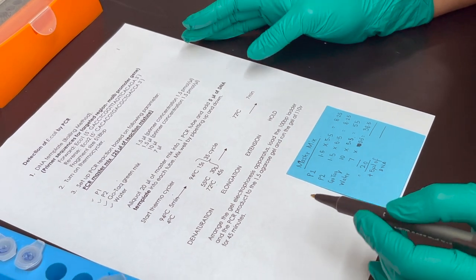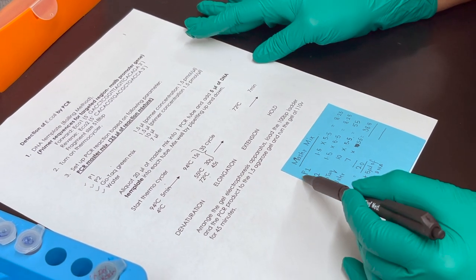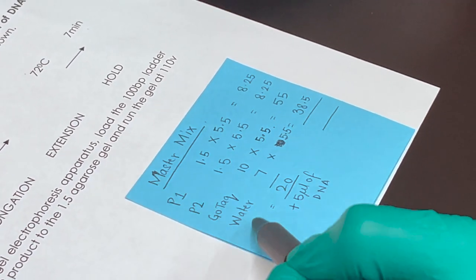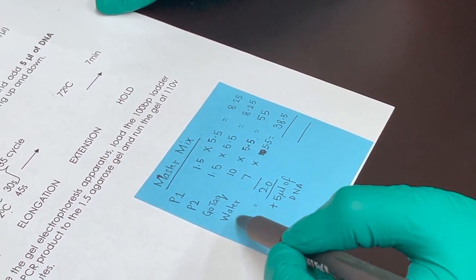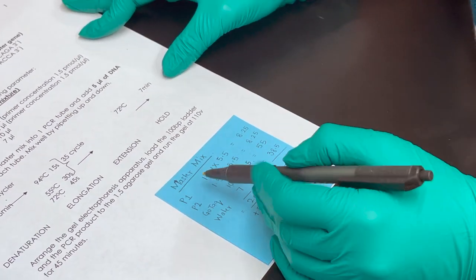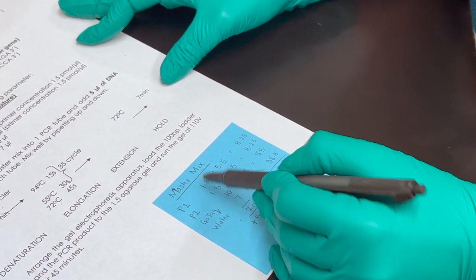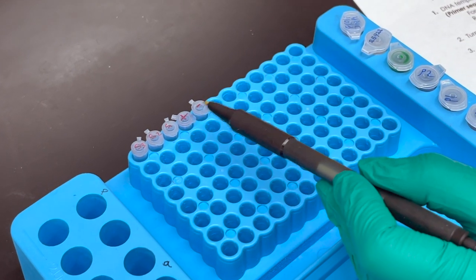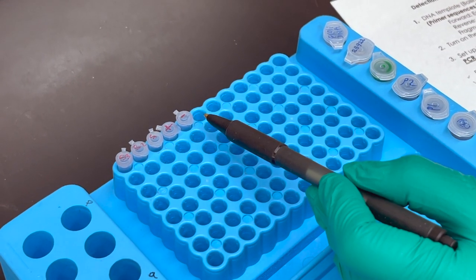To prepare our master mix, we have the forward and reverse primers, GOTAC, and water. The amounts needed in microliters are: 1.5 µL of each primer, 10 µL of GOTAC, and 7 µL of water. We have five samples altogether — one positive control, one negative control, and three replicates of our E. coli DNA sample.